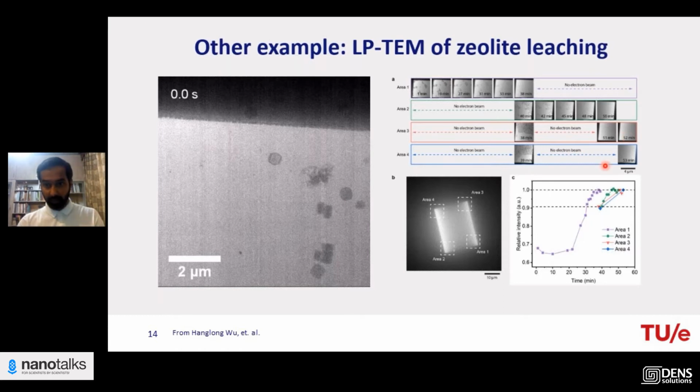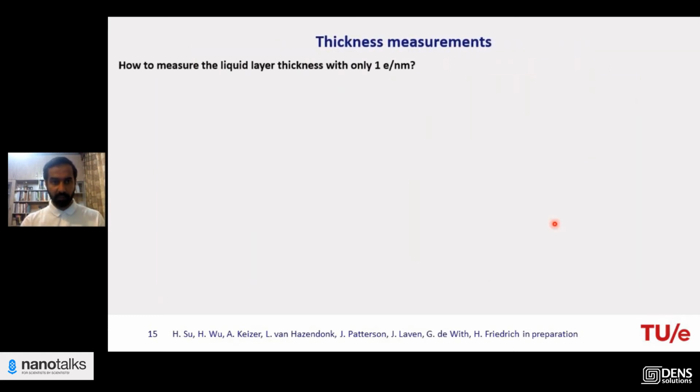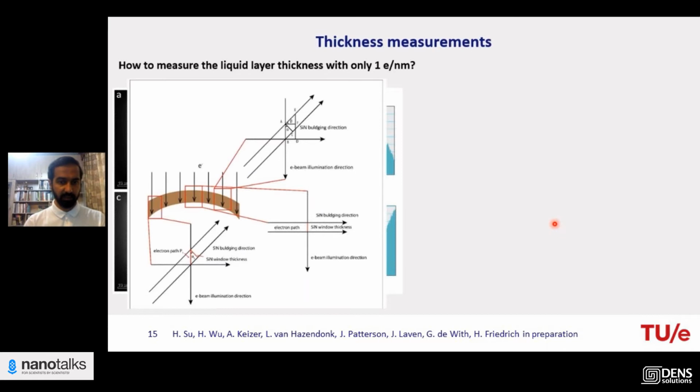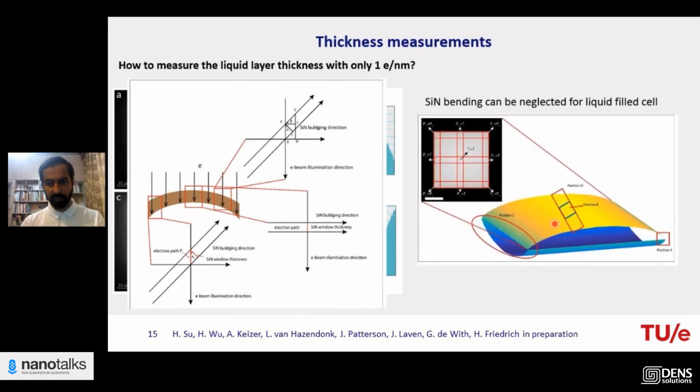So these we have all shown to you, and with all of these, I want to mention something about the calculations of the thickness measurement in a liquid cell, because normally when you have the cell filled with water, you get some bulging effect, and to avoid that in your calculations for background subtraction, we need to consider all of these.